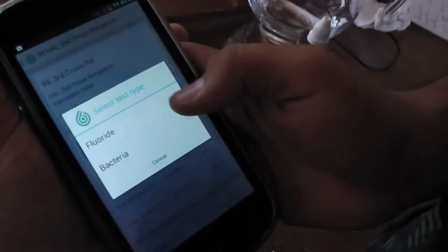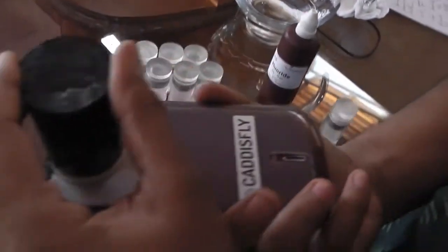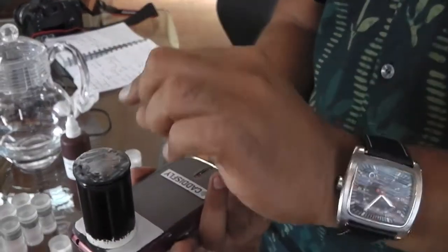It gets its GPS location. You go to location, start new test, and select your test type. Right now there's only fluoride and the bacterial test. Then you hold it this way — at the moment you need to hold it inverted, because there's an air bubble that forms at the top of the cartridge, and you don't want that interfering with the test result.